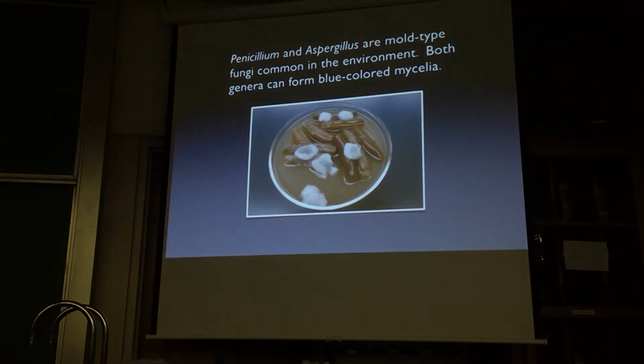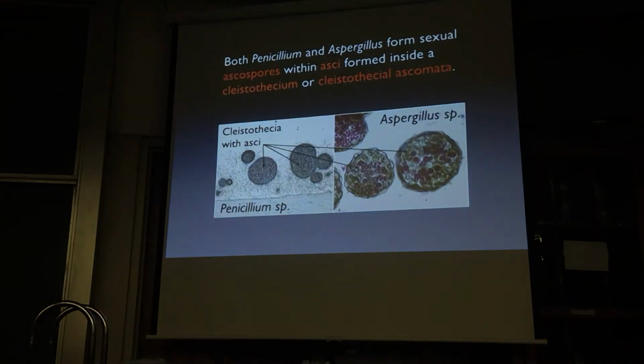That's fungus on some green beans. Would you call it blue or green? Well, those are mycelia. So those are masses visible to the naked eye. They're made up of hyphae, and I think probably that's Penicillium. I left that plate with the green beans sitting on the front counter for a while until Sasha told me to throw it out. I was like, get those out of here.